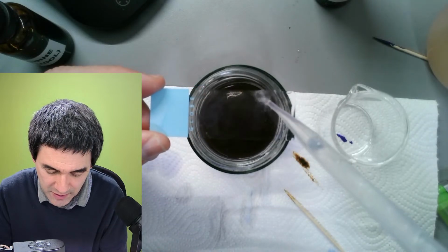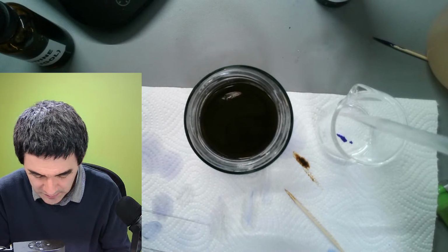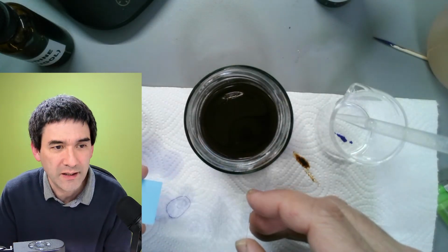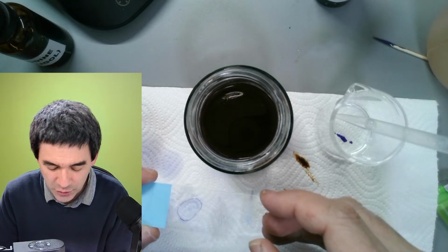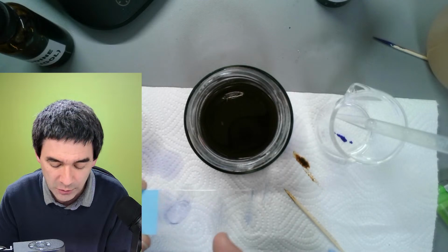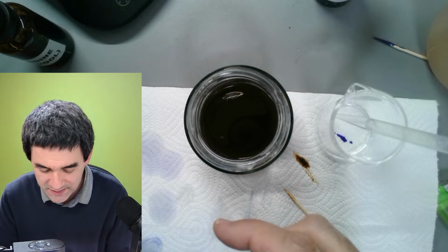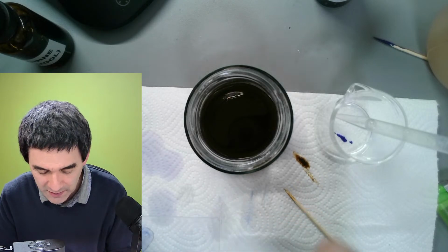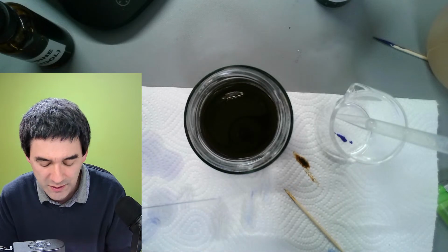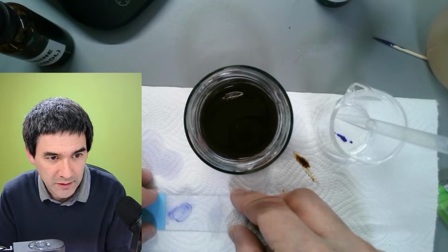Okay, it takes patience. Just by looking at it, we can already see, and I hope this is going to be confirmed, that this one still seems to be significantly darker than this one over here. This one over here, I can still barely see something, I don't know if you're able to see it.